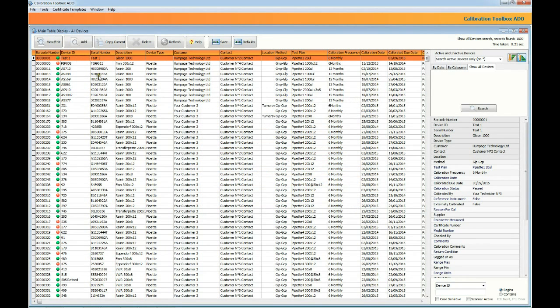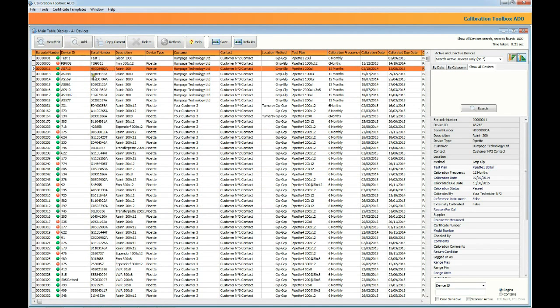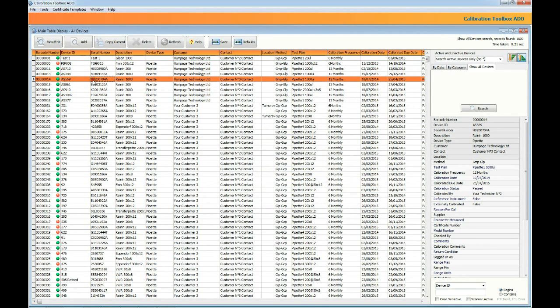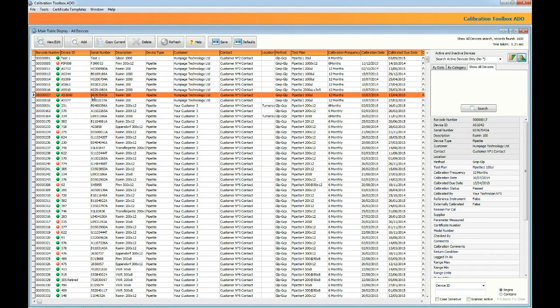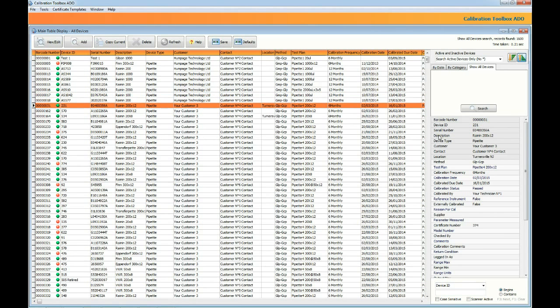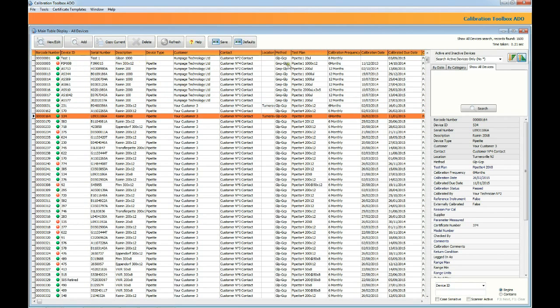We'll close that window down and we're now looking at the main display table. It's listing every device on the database. As I'm scrolling down, the pane on the bottom right hand corner is updating itself to show details of the device I've chosen. You're going to see things like the instrument serial number, the customer who's got it, the contact for the customer, the calibration dates, the test plan, all of the information that you'd expect from a well-maintained calibration management database.